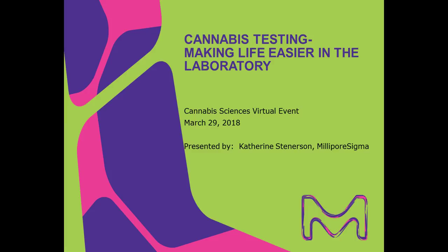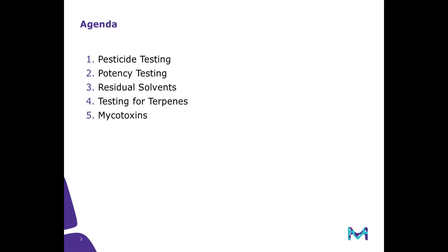Thank you very much, Kaylee, and thank you everyone for logging in to watch this today. What I'm going to be talking about are some approaches for those of you that are interested, or maybe you're already doing testing of cannabis in an analytical laboratory. Some of the approaches that we've found to help some of the pain points for some of the tests that are done.